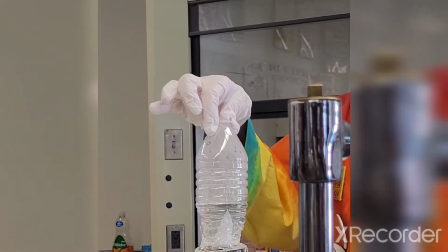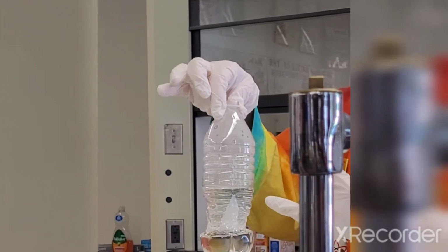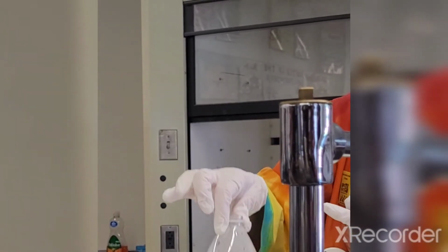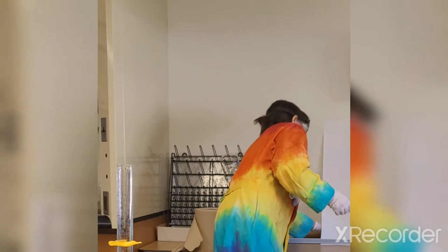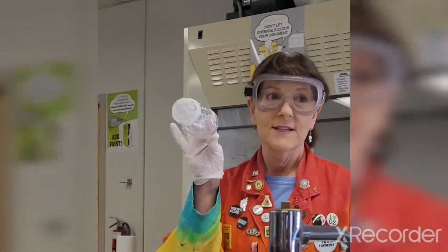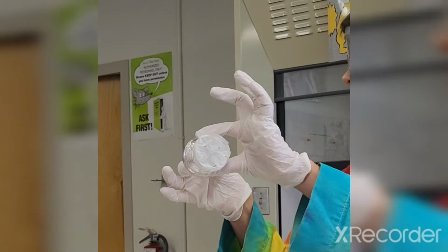Now, before we get out of here, what I think is going to happen, because it's happened in my other classes, is probably this is going to eat through the bottom of the plastic. That's what's happened in my last two classes. This is what happens eventually. Check this out. See those holes? So the acid eats all the way through it, and as you can see, it melts all the plastic.